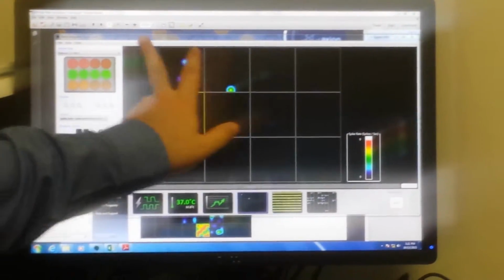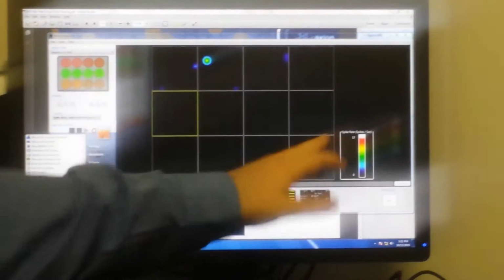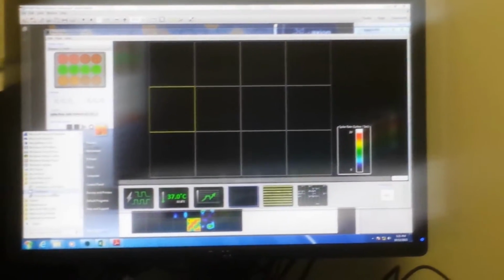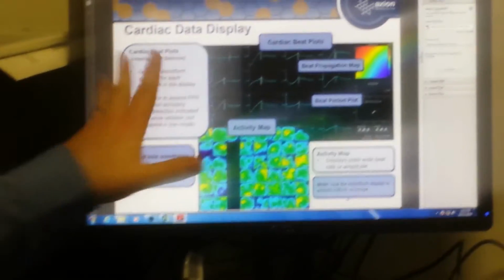We've got Cam Studio, so if you want a recording of it to put into a presentation, it's just screen grab type software. But it's always recorded into raw data, right? Yeah, so when you have the raw data, you can come back and get everything from it. It doesn't really distinguish between the two. Cardiac we'll get into more in the later sessions.